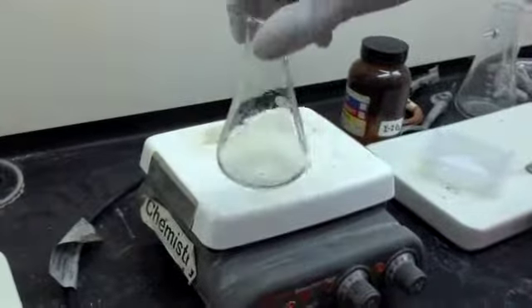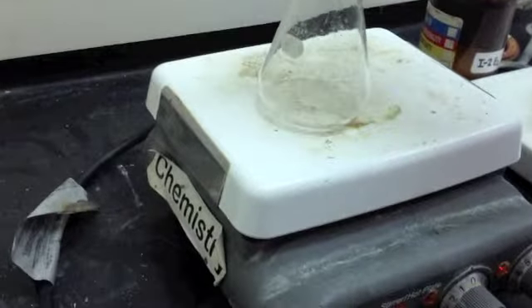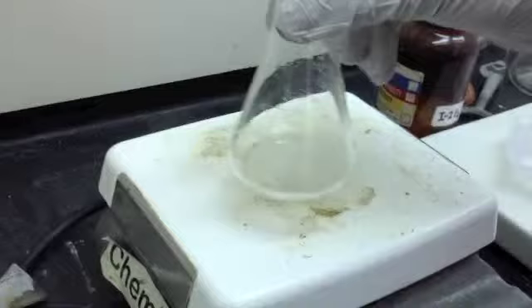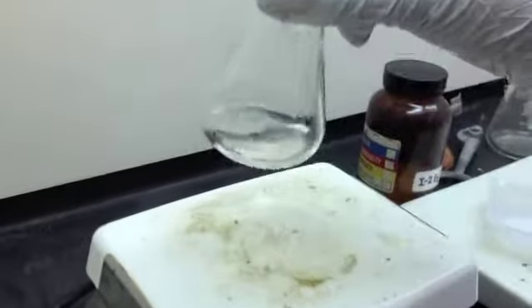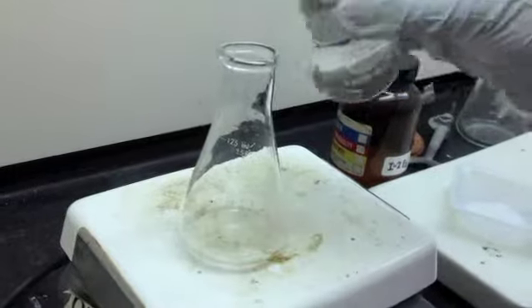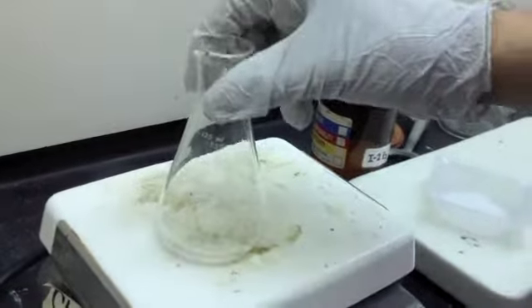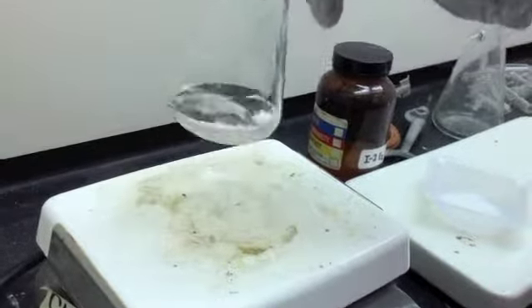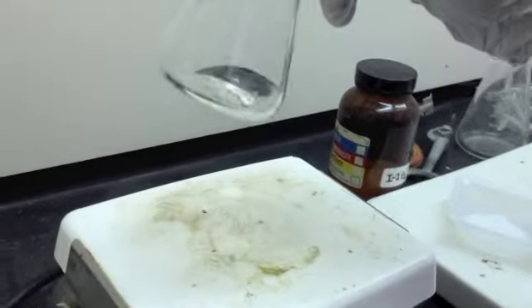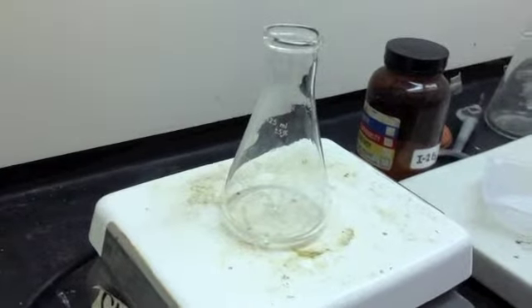And then start to swirl it, see if it'll dissolve. And you'll always want to make sure to keep your Erlenmeyer flask on the hot plate so that it'll dissolve more easily. Right now it looks like there's still some benzoic acid in there, so I'll add a little bit more ethanol. And it looks like it's dissolved. So you want to keep it on the hot plate just a little bit longer.